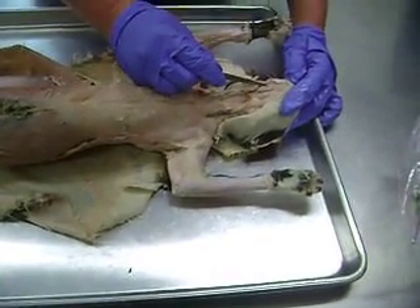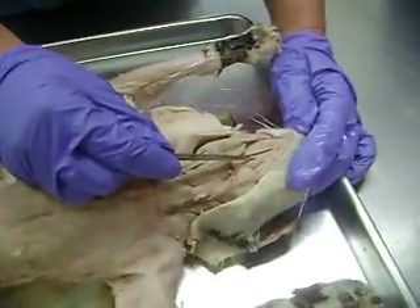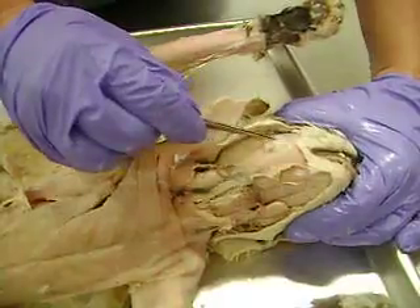Up here below the jaw, these two are digastric, and the one in between is mylohyoid. And just over to the side, the muscle here in the cheek — the nice round one — is the masseter muscle.